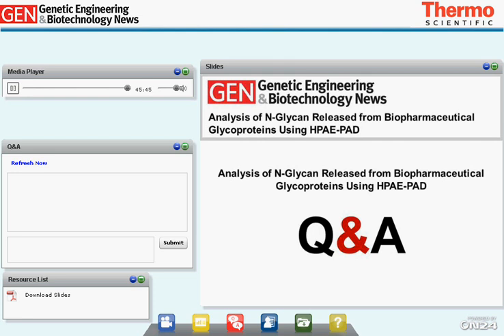Okay, what we observed for 2AB labeled N-glycans, we are around 5 to 10 femtomole. That's the limit of quantification. Anything to add, Peter? I would basically confirm what Sebastian is saying. Okay. So femtomole range.